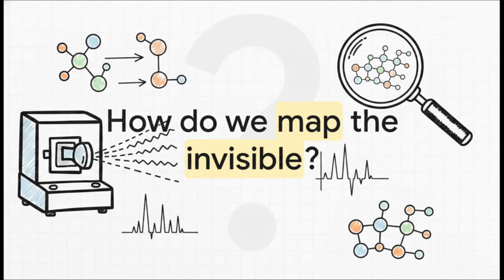How do we prove beyond a shadow of a doubt that a specific molecule successfully attached to a nanoparticle, or that a complex chemical reaction completed perfectly? Well, we use a highly specialized tool called FTIR, which stands for Fourier Transform Infrared Spectroscopy. In the fast-paced world of nanotechnology, FTIR is basically the ultimate detective's magnifying glass. It allows researchers to identify, confirm, characterize, and map chemical structures at the nanoscale, all without ever needing to physically see them in the traditional sense.